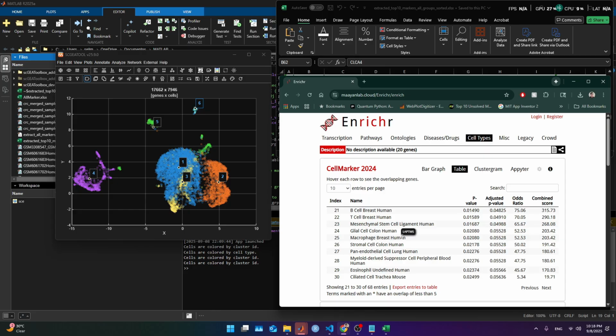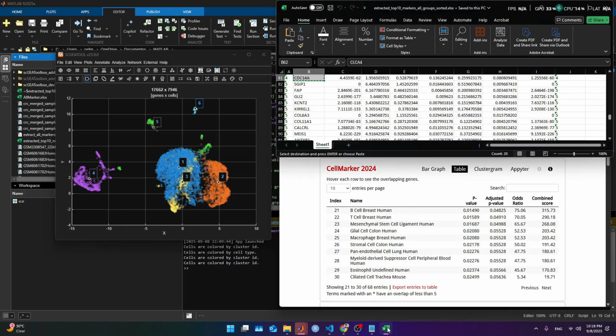Stromal cell, macrophages. So this is gonna be a hard cluster, and that might be because it's already repeated to some extent. If we remind, we already identified the rest. So if this comes in hand, that means that that is complicated.